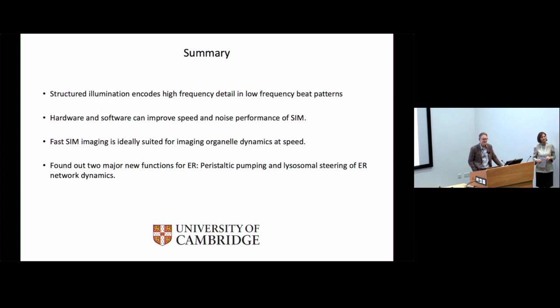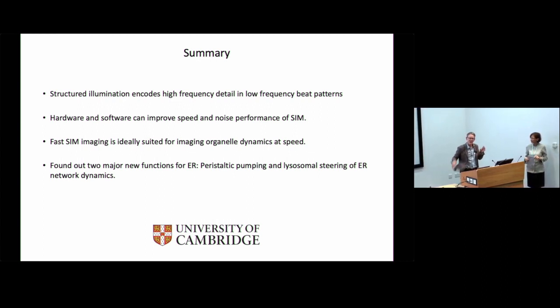If you compared custom SIM imaging and commercialized SIM imaging, is there any difference between resolution? No, the resolution, if you optimize a commercial SIM system, can be very good. For one color, it's very good. Ours is certainly better if you have several colors imaging at once. So we can really put all the colors in at the same time and get all the patterns simultaneously. So that will not be possible. We can get to just about under 100 nanometers, wavelength dependent.